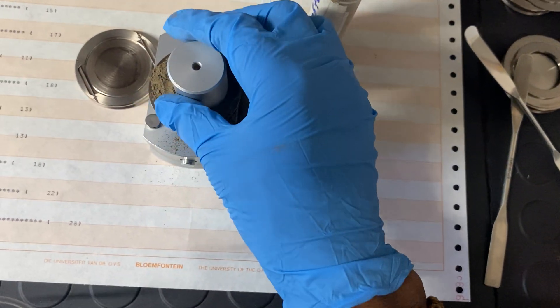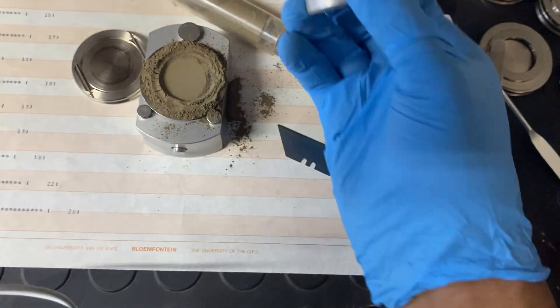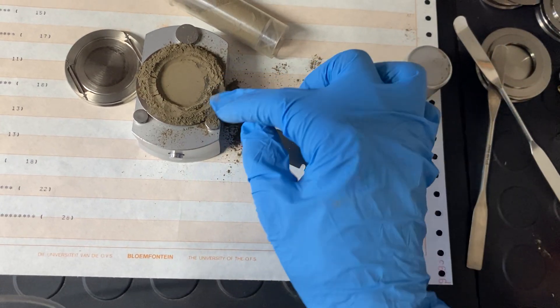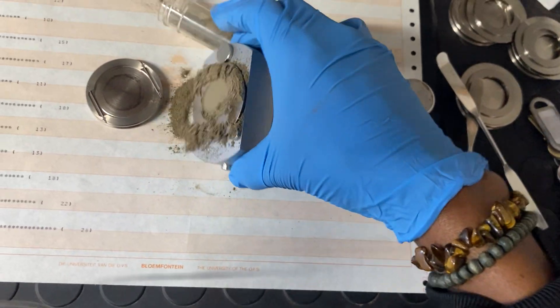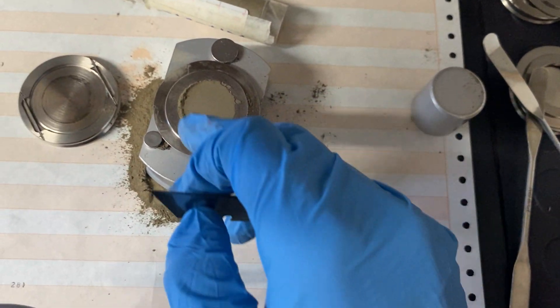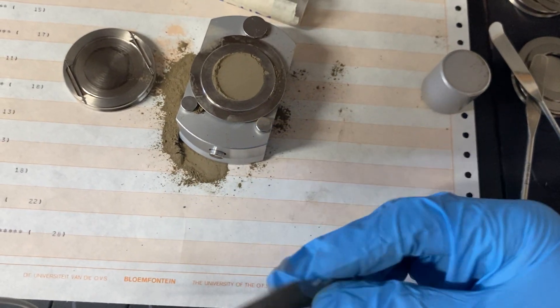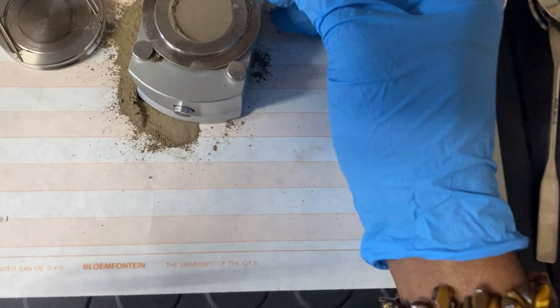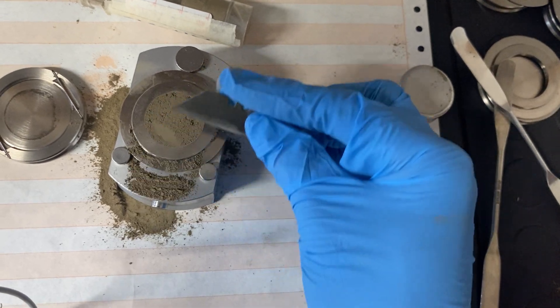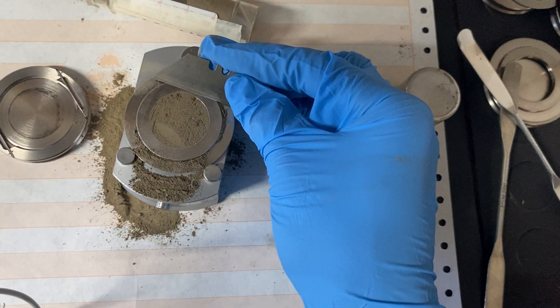After pressing, we can press again to ensure a firm, flat surface. After pressing, there will likely be excess powder around the edges, as you can see. We remove this excess using the razor plate, gently scraping until the surface is flat.